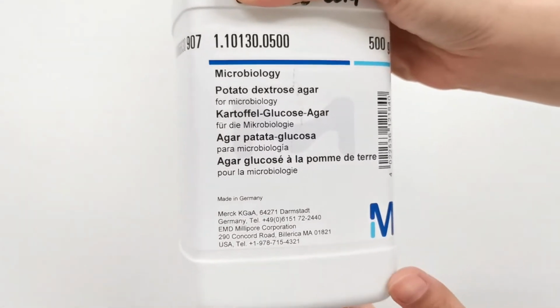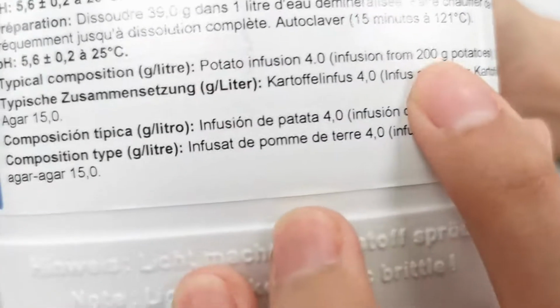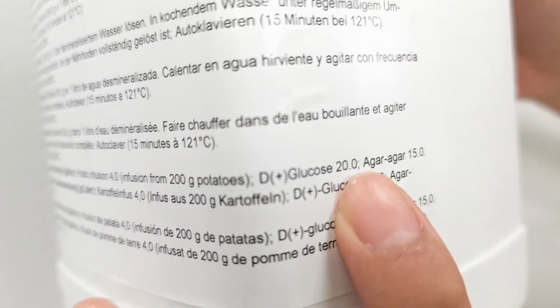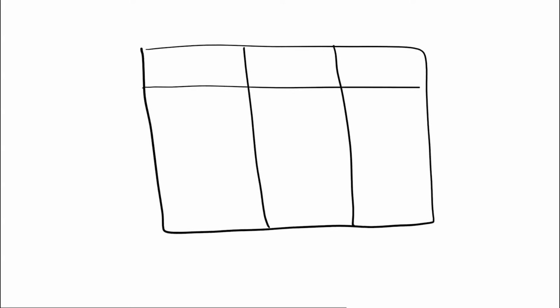This is a ready-made dehydrated PDA. The media consists of 200 grams of potatoes, 20 grams of dextrose sugar and 15 grams of agar. We will resemble the composition for preparation of PDA from fresh potatoes.